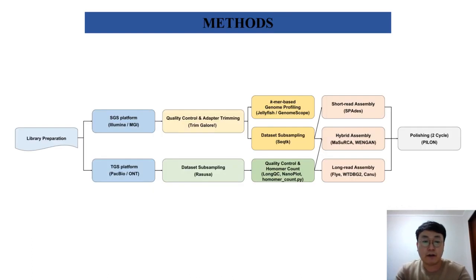This is our pipeline. We sequenced repetitive yeast genome in 4 sequencing platforms and subsampled in 6 steps and assembled in 6 ways.